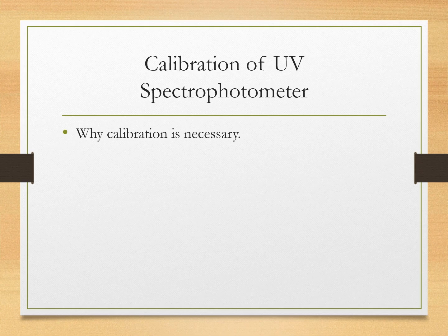We find the results of known samples, standards of known concentration. When a known concentration is measured, we can see whether the instrument is working properly.